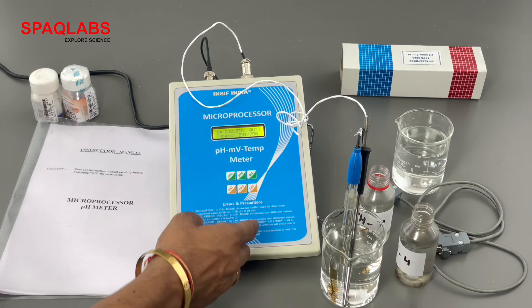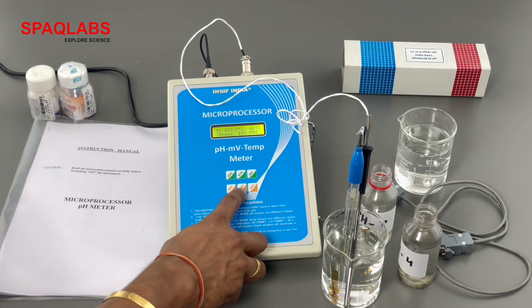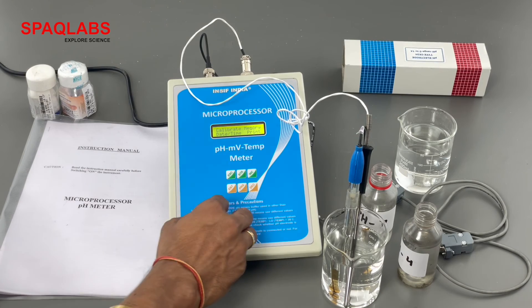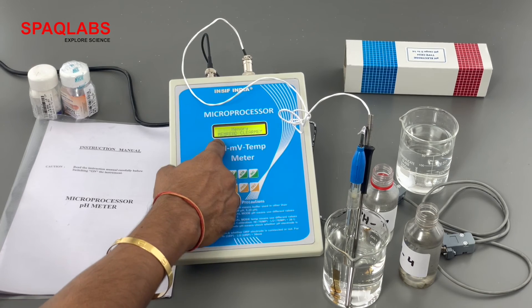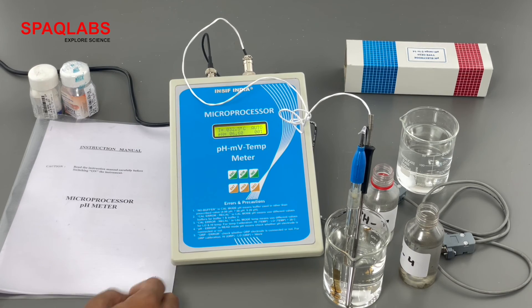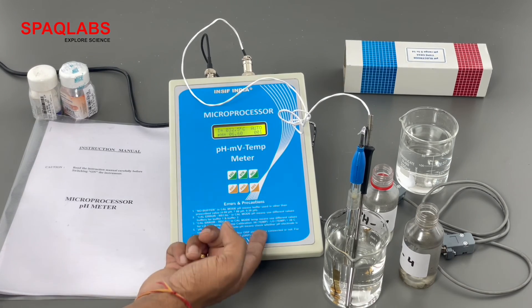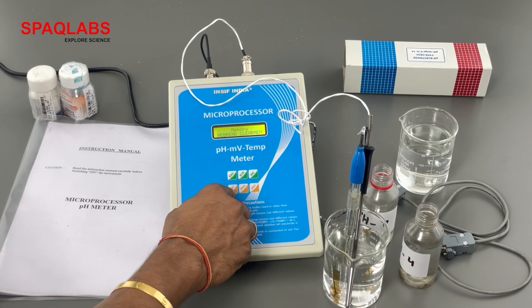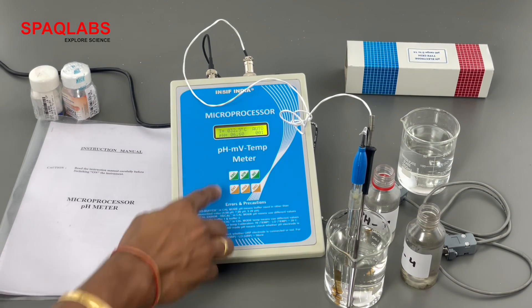If you want to read data that is already stored, press program, then go to memory and press enter. In memory you have two options: clear memory or read memory. Select read — it shows the value stored at location 1 along with the time and date of that reading. Press escape when finished.